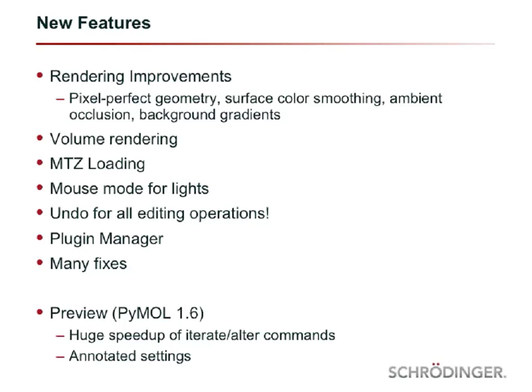PyMOL can now load MTZ files, which is very important for crystallographers. We have a new mouse mode for light, so you can have up to 9 lights in PyMOL and easily place them with the mouse in 3D space. For editing operations, we now have a working undo for all editing operations, like cutting out atoms and moving coordinates of atoms, and also for deleting objects and loading objects.